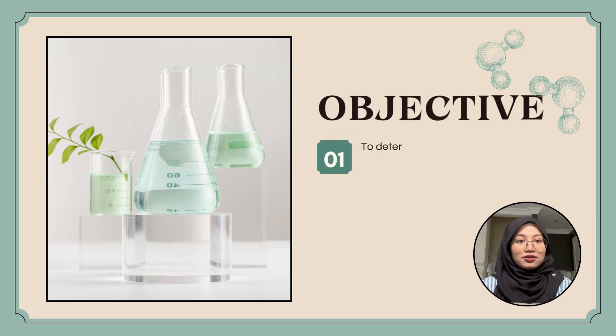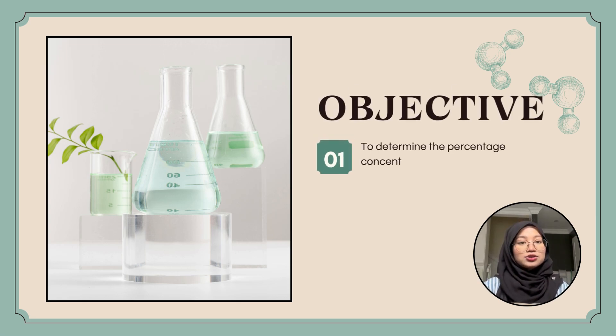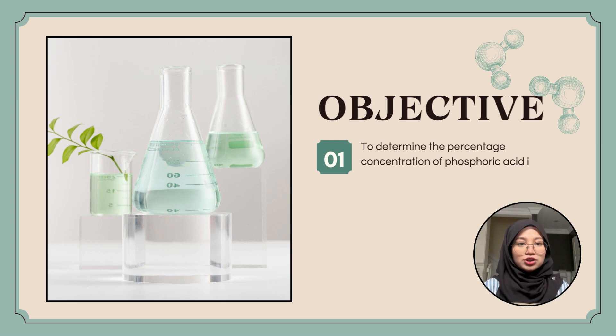The objective of this experiment is to determine the percentage concentration of phosphoric acid in Coke.